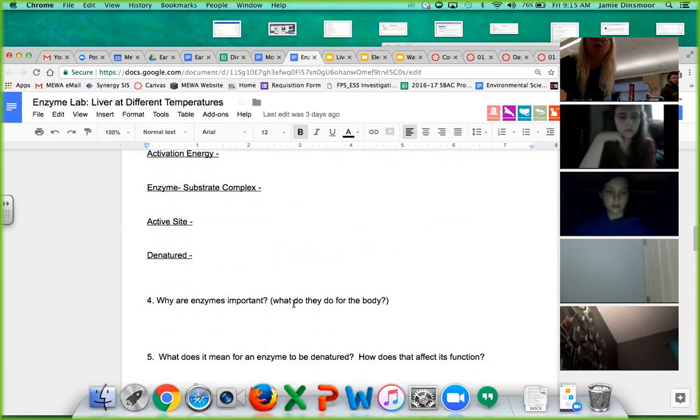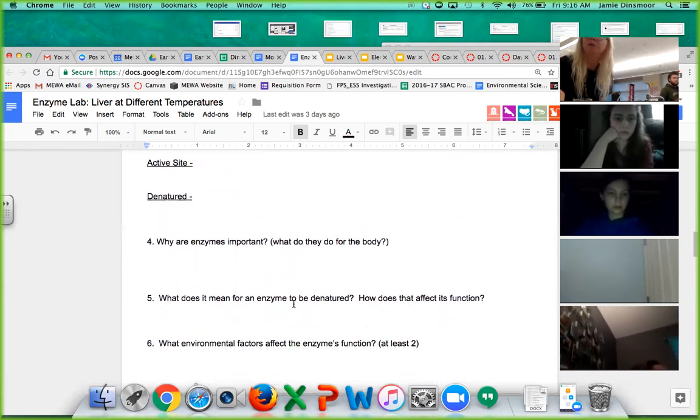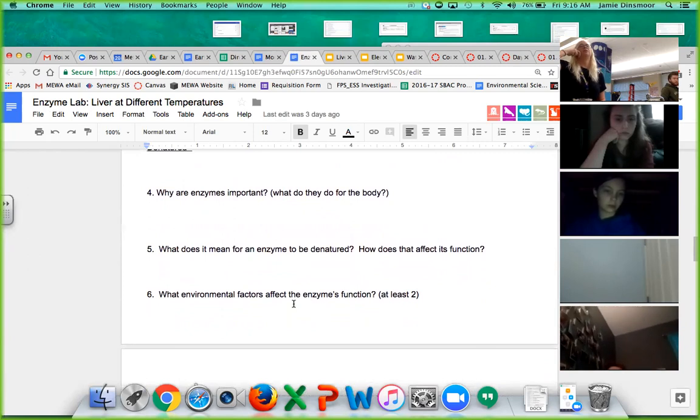All right, why are enzymes important? You guys are going to answer that yourselves. What does it mean for an enzyme to be denatured? You're going to answer that yourselves. And then what environmental factors affect enzymes' function? I will help you out with this question number 6 here, right?